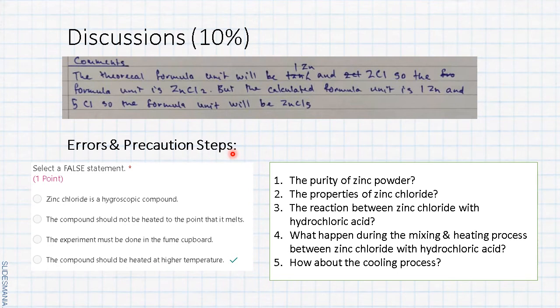Next is errors and precaution steps. You have to identify two things: for the whole process, why is there error? There's one question during pre-lab asking about select a false statement. The answer is D: the compound should be heated at higher temperature. No. While for the heating process we have to heat it slowly. Zinc chloride is a hygroscopic compound, yes. We cannot heat to the point that it melts, yes. The experiment must be done in the fume cupboard, yes.